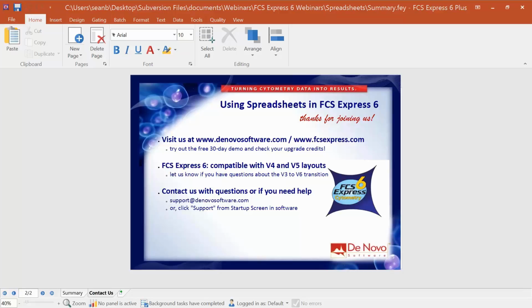If you didn't realize, FCS Express 6 with the spreadsheets functionality is compatible with all version 4 and version 5 layouts. So if you have any candidates for analysis where you want to bring your version 4 and version 5 layouts into 6 so you can start working with spreadsheets, that can be accomplished.